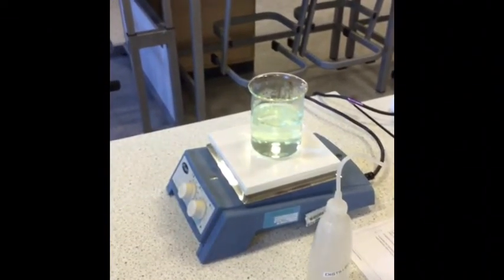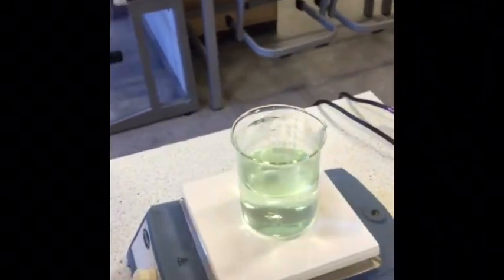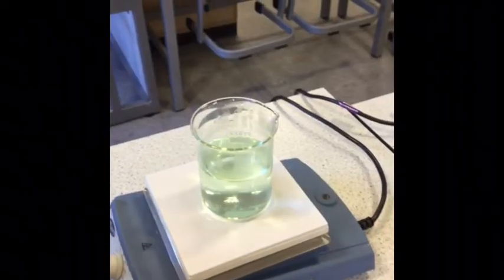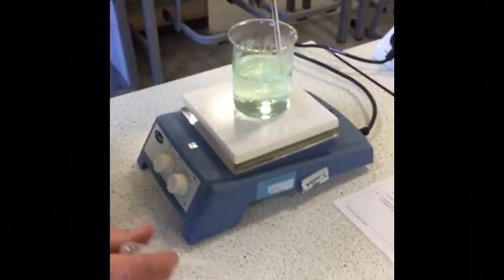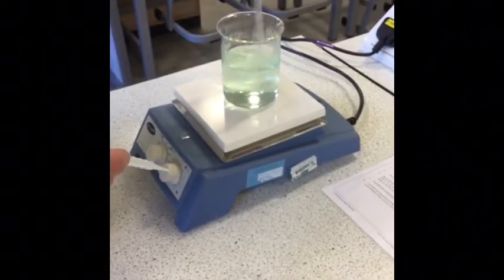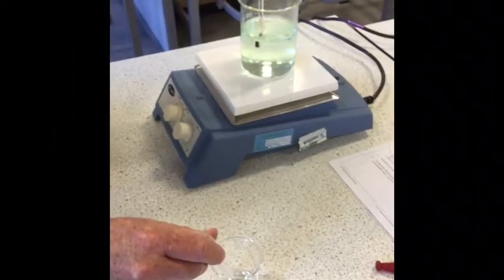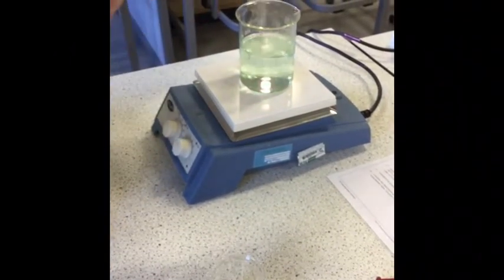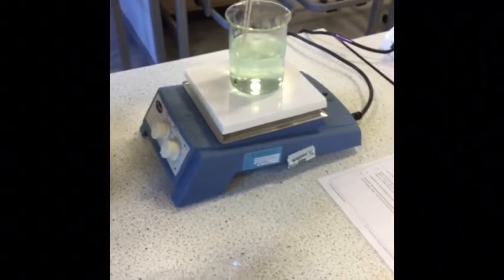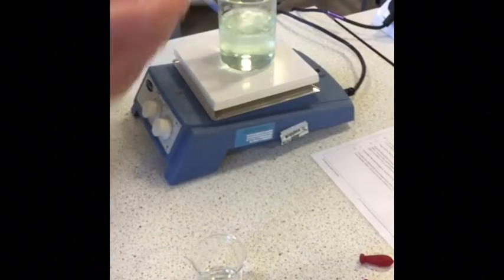So I've measured out 30 cubic centimetres of ammonia solution here, and I'm going to start adding it, maybe not quite dropwise, since it would take an awful long time to add 30 cubic centimetres dropwise. So I'm adding squishes. And did you see that red colour appear? Watch for it again.